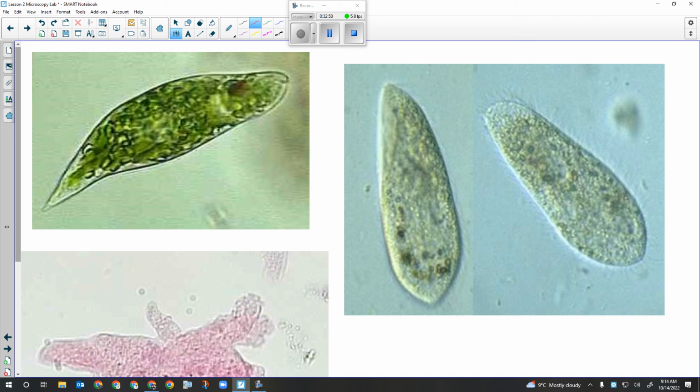These specimens are all preserved, so they're dead. So they don't go anywhere. But if you're trying to look at a paramecium when it's alive, you have to put glycerin, which has the same consistency as pancake syrup, onto the slide to slow them down. Otherwise they just go flitting across the field of view because they're really, really quick. Those cilia wave back and forth and they can just motor. So if you put the glycerin in there, they get all gummed up and they can't move very well. They're going to be pretty easy to find.